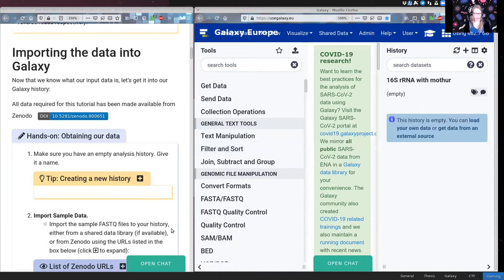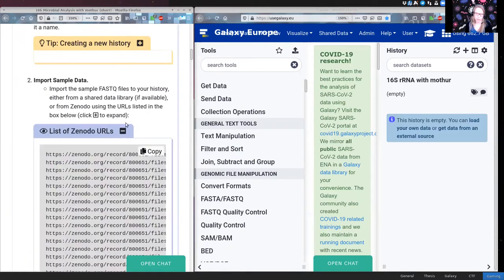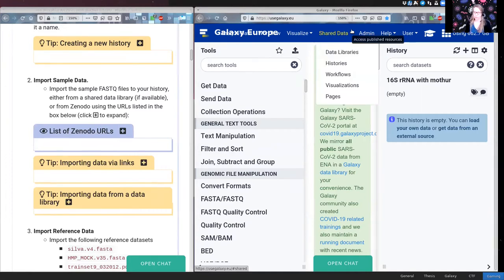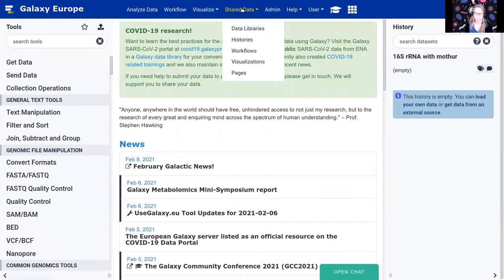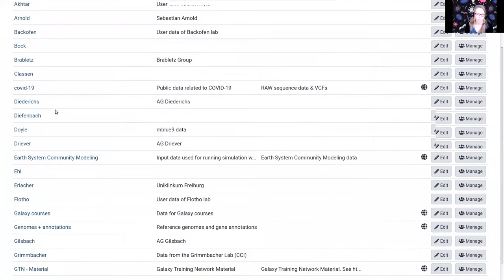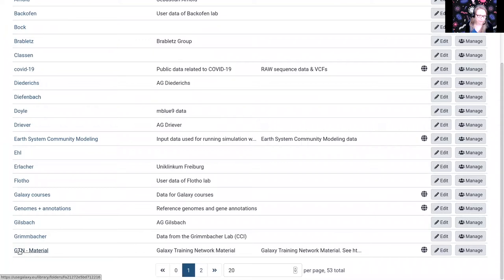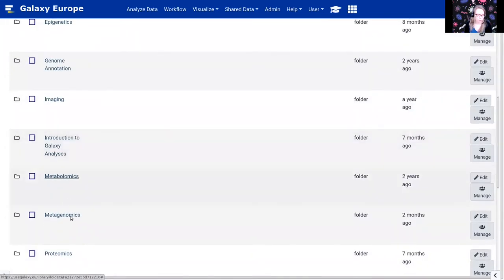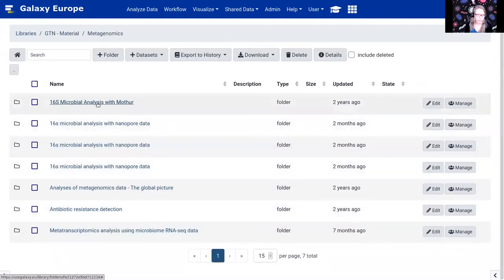There are two ways to get your data: there are links in the tutorial to Zenodo, or on big Galaxy servers the data is in a shared data library. To access shared data libraries, go to Shared Data > Data Libraries at the top of Galaxy. You should see the GTN-material data library. Click on that, navigate to metagenomics, then to '16S microbial analysis with Mothur', select the highest version number, select everything, and export to history as datasets first — then we will make the collection later.